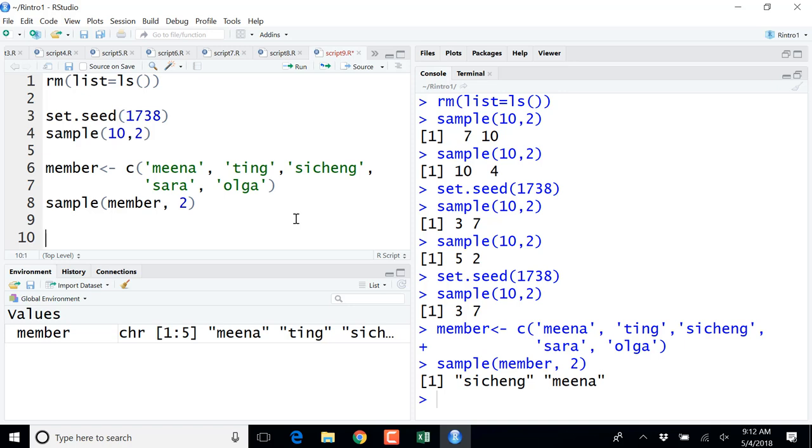So let's remind ourselves of the experiment design for the IPRG data. In the IPRG data, we have 4 conditions, each with 3 replicates. So in total, we need to run 12 MS runs, right?